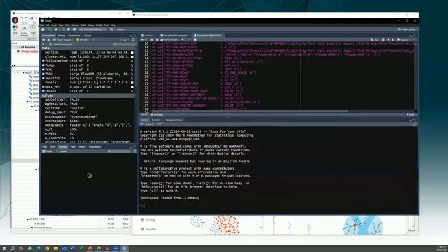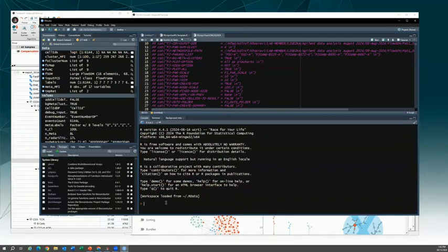It might say it's going to create a folder to install R packages where you have read-write permissions. If you're on a work computer, you might not have the permissions to install R packages in the default location. So if you run install.packages and install a package like png, and just hit enter. If I do it here, it's already installed, so we won't see the actual message that I'm describing.